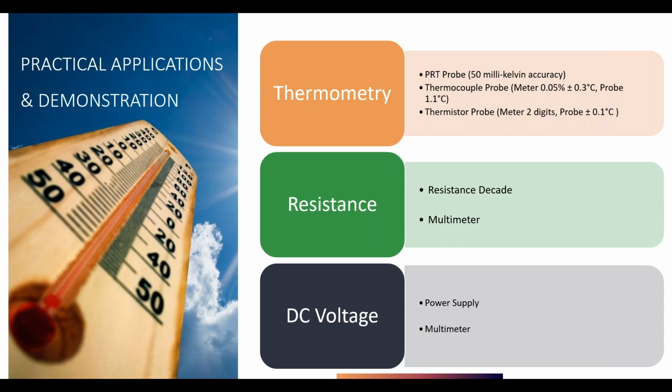In a cup of water, and I've got an 8-degree difference across the board on all these thermometers. Okay, well, what's the problem? In their mind, they're thinking these should all read the same, but I'm trying to stir it as well, too, right? So in my mind, I'm thinking, nope. And so then the questions begin.